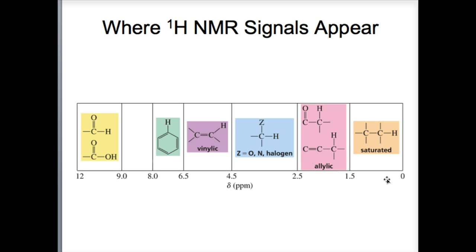Here are NMR signals for various compound groups. There are actually 7 regions of the NMR spectrum, of which one is empty right here. There's no example given. Each of these is an approximate value of the chemical shift for different kinds of protons in various molecules, as you can see in this table. Table 15.1 has more values, and the study guide and solution manual has many more in a table in the manual.